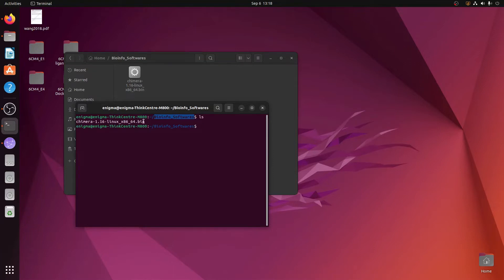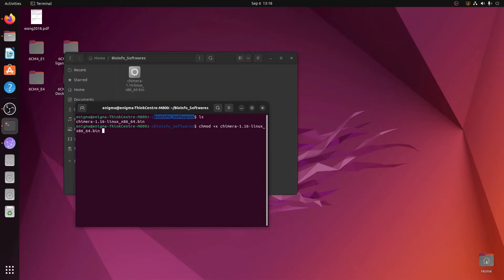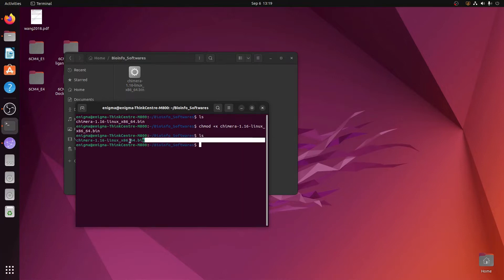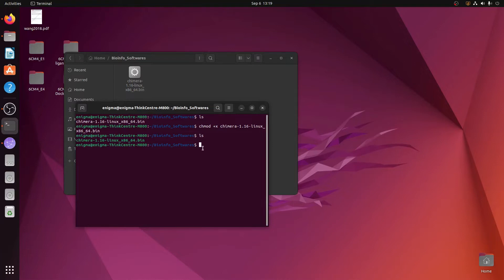The file is shown in white-colored font, which means it is not an executable file — you have to make it executable. To convert this non-executable file to an executable, the command is: chmod plus x, then type the initial 'ch i' and press Tab so the full name is auto-completed, then hit Enter. When you press ls again you will see the Chimera bin file name has turned green, meaning it is now executable.